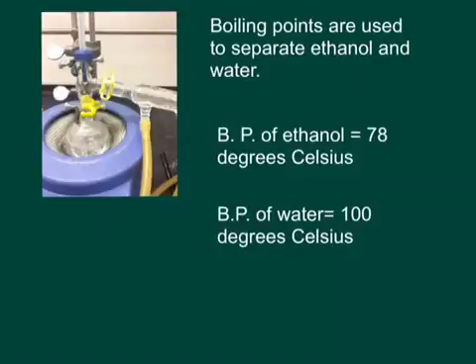However, because there's not much surface area to work with, water is still evaporating. The distillate is slightly a mixture of ethanol and water. As will be explained later, in fractional distillation we are able to get a richer compound of ethanol in our distillate and not as much water.